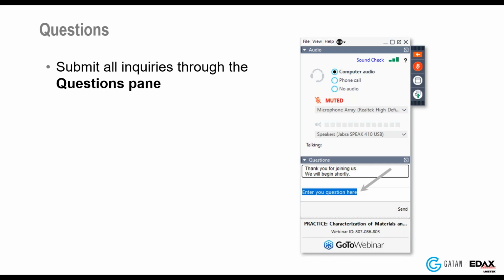Okay. Have you tried the technique with anode materials such as graphite anodes? No, not yet. We've done some further tests, or we have other tests in progress and have used the technique on some other cathode materials. We looked at lithium iron phosphate, for example, but we haven't extended it to anode materials yet. And we're hoping that we have plenty of customers who will look to push in that direction for us.